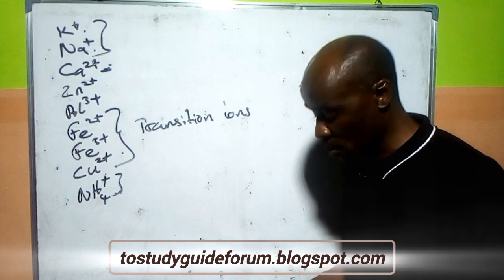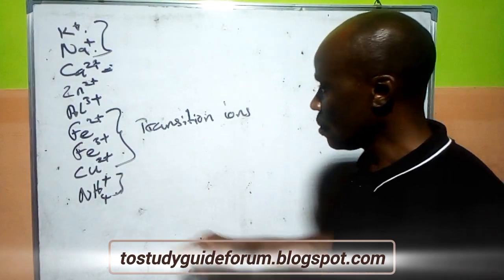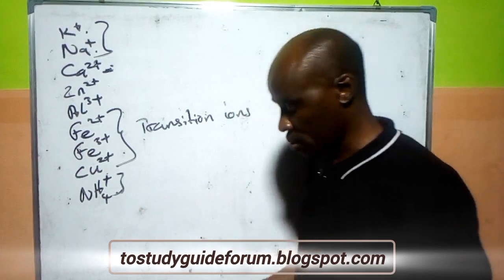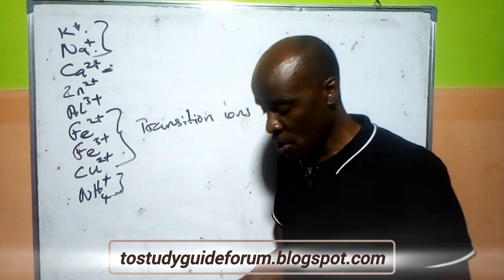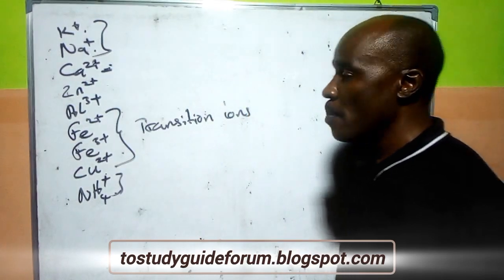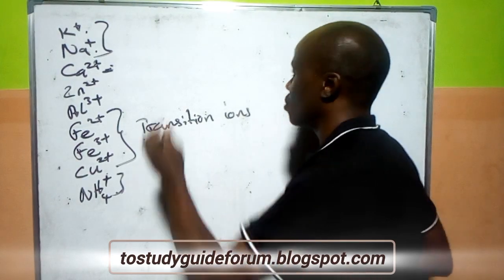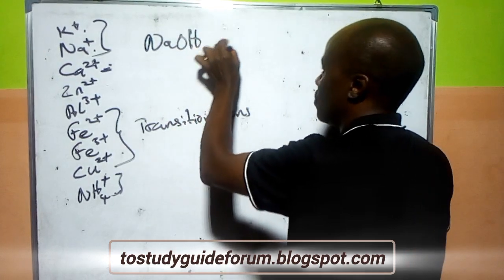So now the next one we look at here, like I already told you, has iron 2, iron 3, and copper 2 ion. Like I told you, they are all what we consider to be transition ions. There's another thing I want us to look at here. Now there is salt. These ions in their salts, the reagent for these reactions, which I will just rest my case there, is sodium hydroxide and what?